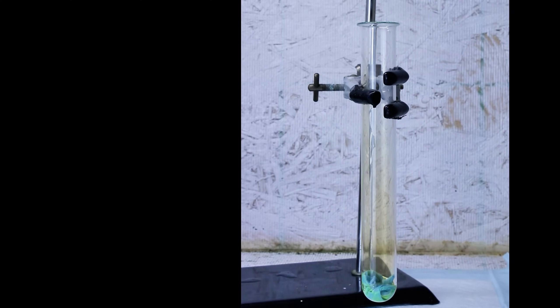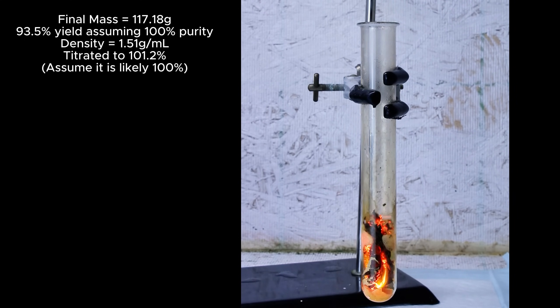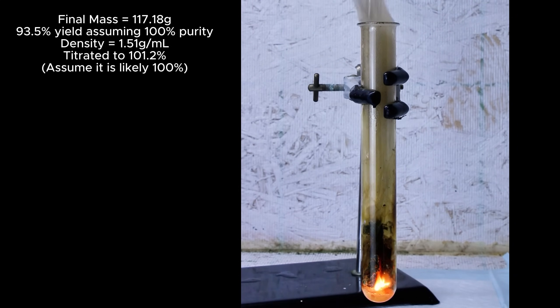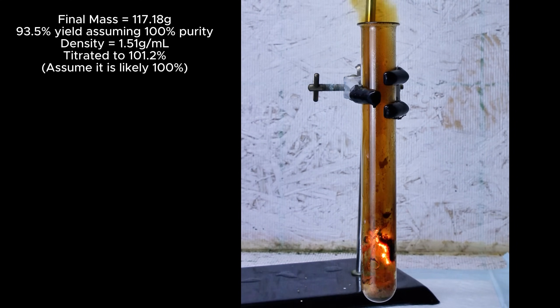Anyway, in the end I got a final mass of 117.78 grams which represents a 93.5% yield, with virtually all of my loss being due to decomposition into nitrogen dioxide. The nitric acid here has a density of 1.51 grams per milliliter and I titrated it to basically 100% if you account for human error.